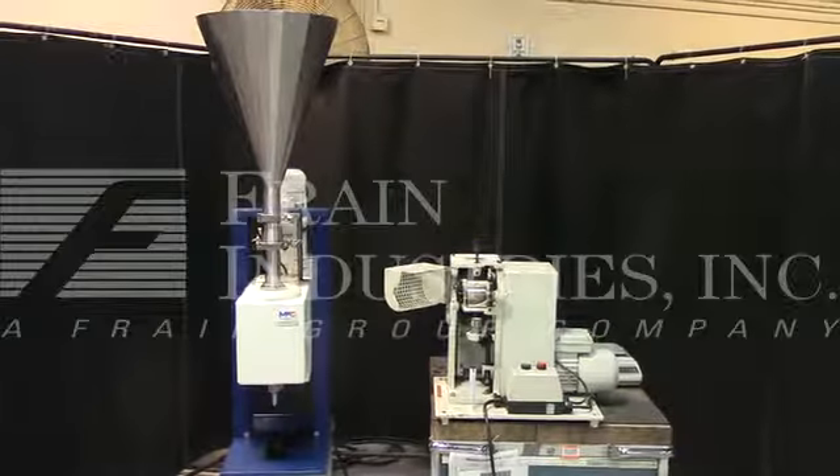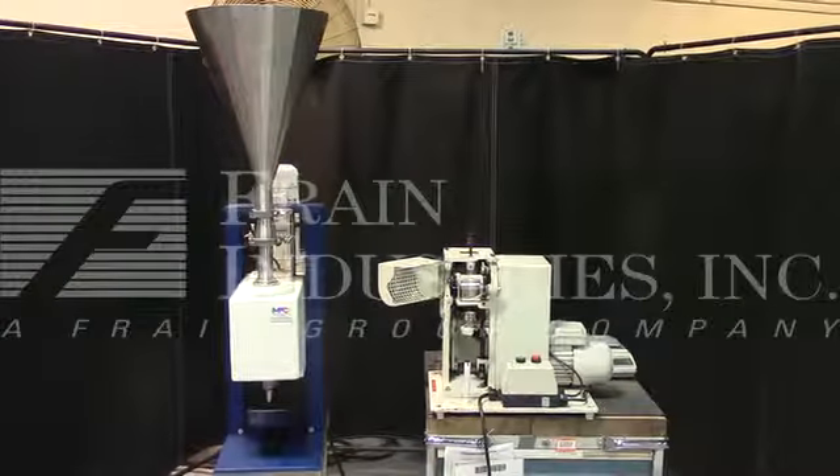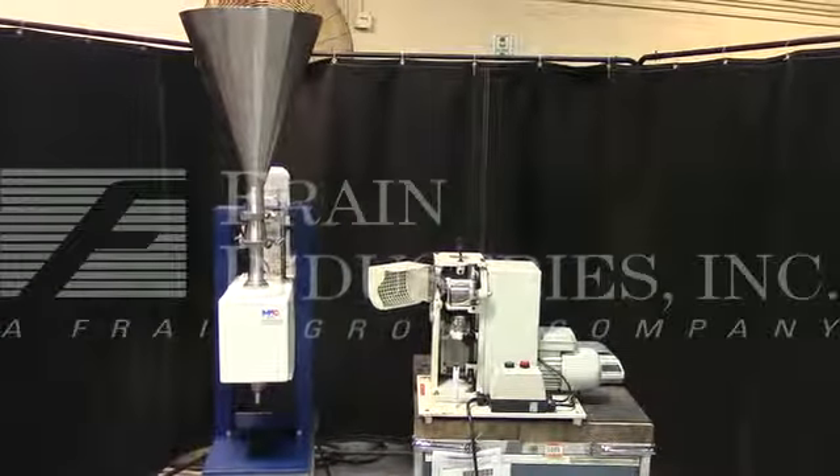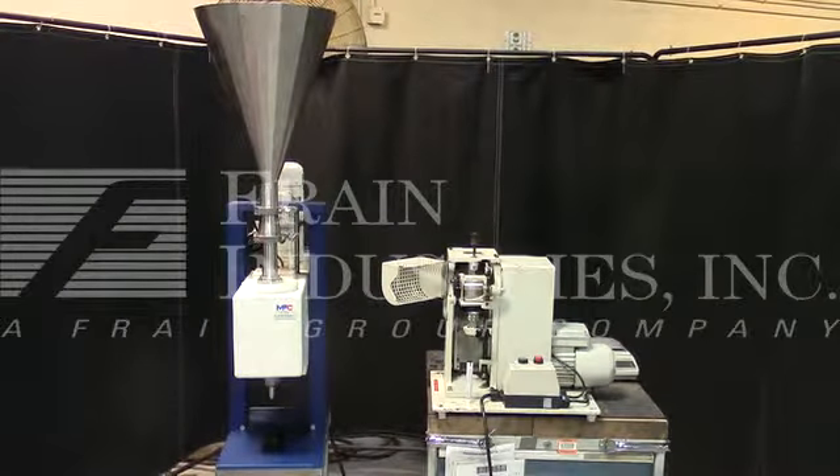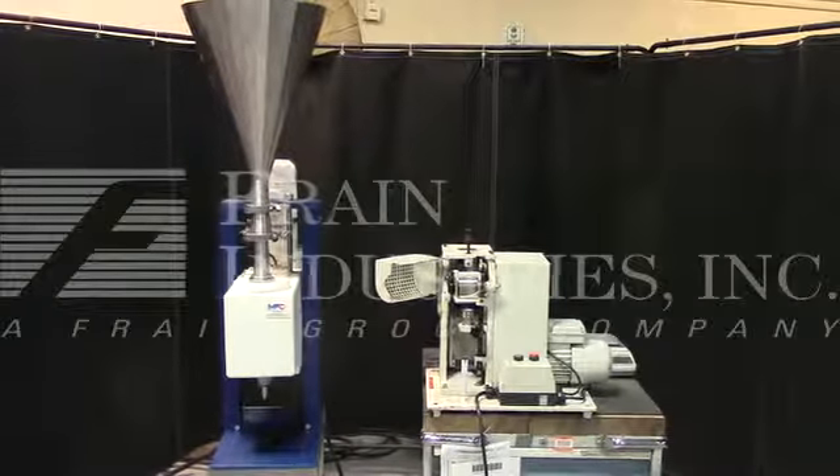The voltage on the machine is currently set for three phase, 60 cycle, 240 volts. We recommend a field service technician to assist with your start-up and training on the machine. Please contact our field service manager to meet all your field service requirements.